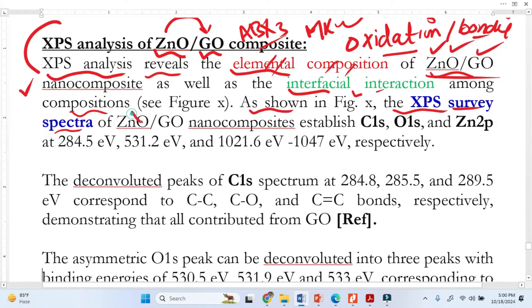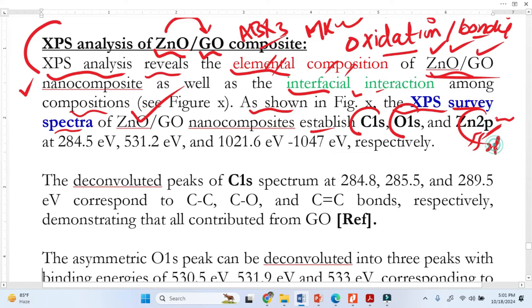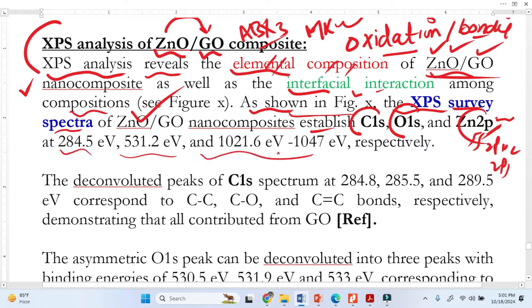We continue: 'As shown in the figure, the XPS survey spectra of this nanocomposite establish the carbon 1s peak, oxygen 1s, and zinc 2p.' For the survey spectra we talk about it briefly and mention the main binding energies. If you can identify the binding energy that is good; if it is difficult, you can explain these energies at the high-resolution spectrum stage.